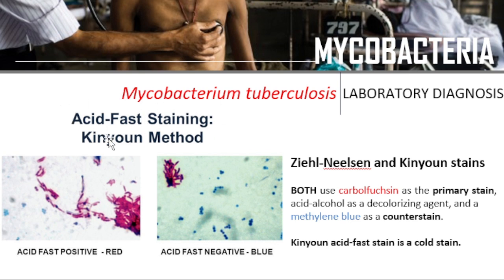Now the acid fast staining can be done by two methods: it can be Kinyoun or Ziehl-Neelsen. The Ziehl-Neelsen is a hot method wherein it uses carbolfuchsin as the primary stain, applied with heat. While you put the carbolfuchsin on the smear on the slide, you add heat to the stain, and the heat will serve as the mordant, enhancing the affinity of the primary stain to the cell wall of the bacteria.